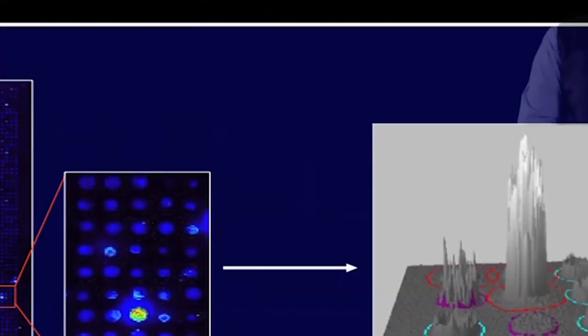In image analysis, when you are talking about high density approaches, the analysis becomes very challenging. For example, you can see an image here for the protein microarrays and I have shown a spot. The expression of this particular immunogenic protein is so high that it has spilled over to the neighboring proteins. One needs to correct this type of error and remove these spots which are in the periphery of these proteins. Scaling up is a good approach because one wants to perform high throughput experiments so that thousands of features can be studied simultaneously. However, while scaling up, especially when you are using cell-free expression based approaches, one needs to be cautious about what the optimum intensity for the arrays should be.